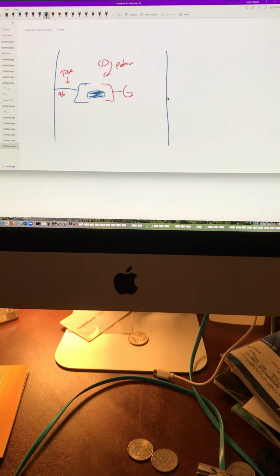So we just washed it. Did you see it went away? So you run the protein. Second thing is you run the antibody with the label, and then third thing you zap it with a laser. So this is another way.